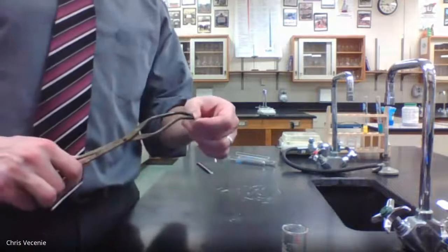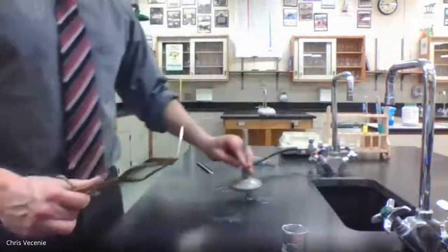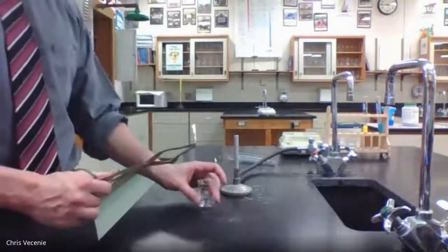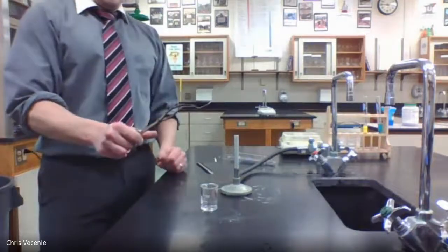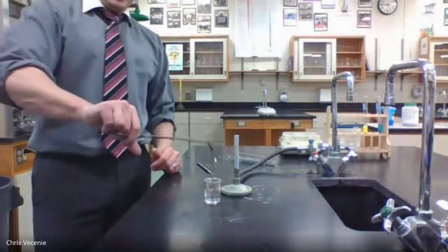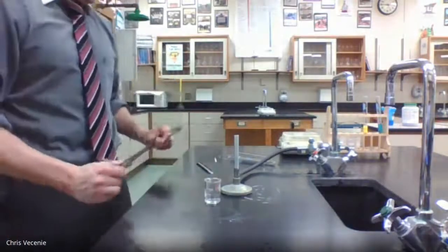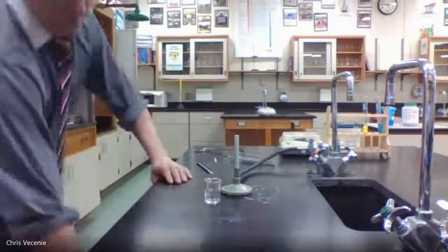And then what I'm going to do is light this on fire to let it react with the oxygen in the air, which is 4A. We're going to let the magnesium react with oxygen in the air. And then I'm going to try to catch the ashes inside this little beaker that has some water. All right, so I'm going to start my burner up again.